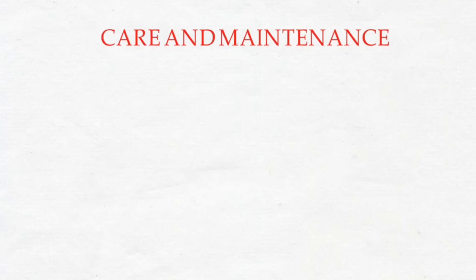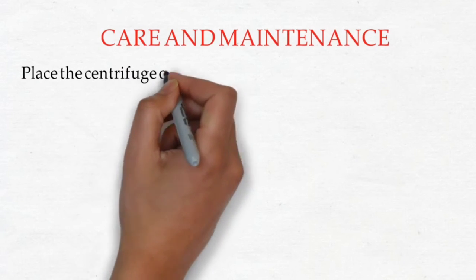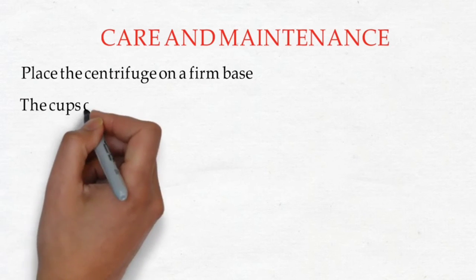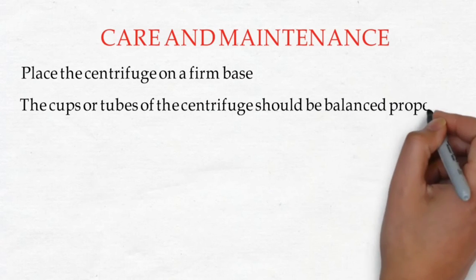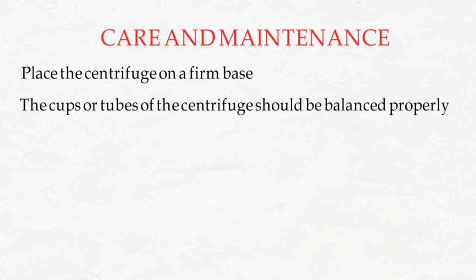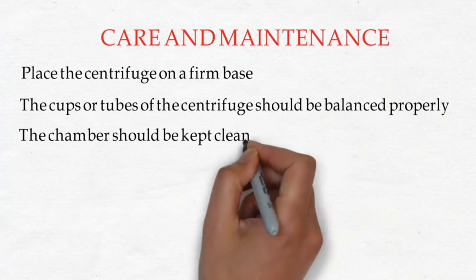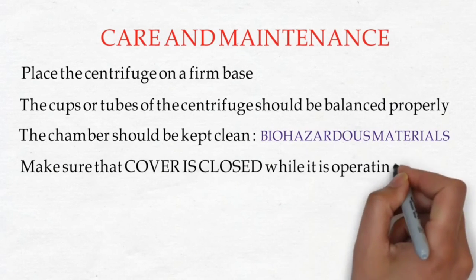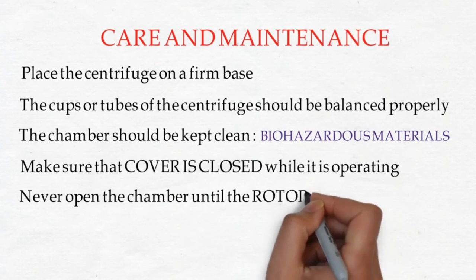For care and maintenance: place the centrifuge on a firm base, but not near sensitive equipment such as a photometer or spectrophotometer, as it generates electrical noise and high current drain on startup. Cups or tubes should be balanced properly — load must be balanced by equal mass and center of gravity across the rotation. Do not run the centrifuge with buckets or tubes missing. Keep the chamber clean; clean all spills immediately as they may contain biohazardous materials. Ensure the cover is closed while operating, and never open the chamber until the rotor has come to a complete stop.